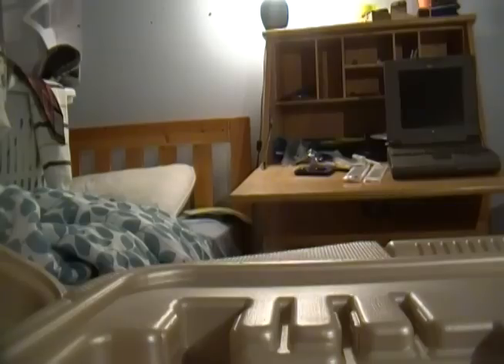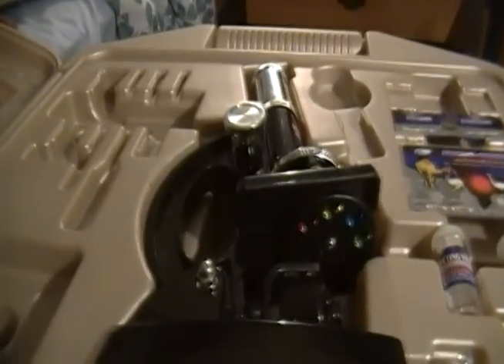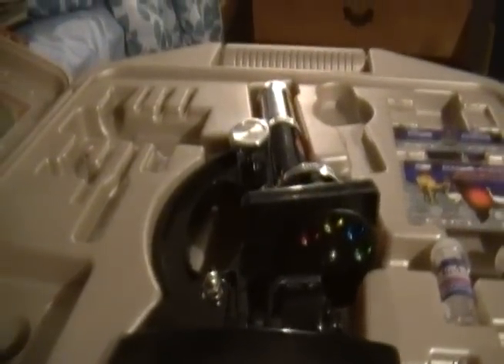I still actually have some of these — you can see in there, I have some glass slide covers. Let's get the microscope out and demonstrate it. The camera was paused the entire time I tried doing that, so now I have to do it again. On the front it boasts the different zoom modes: 100 times, 600 times, and 1200 times.